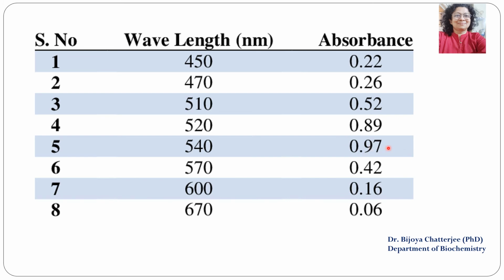And you know that the ideal absorbance lies between 0.1 to 0.6 or 0.7. So if a small concentration is giving such a high absorbance, when we go to the higher concentration tubes, the absorbance will not be measured at all. So for such compounds which give very bright colors or which have very intense colors, the lambda max cannot be selected. So this is an exception to the rule.